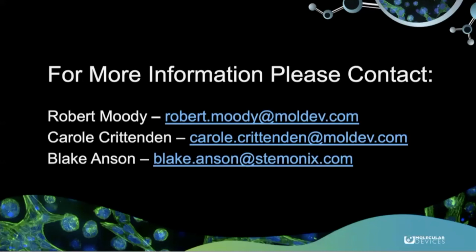Not built into the software, but we are able to pull out quite a bit of granularity and robust features across the phenotypic output, and that is then ready for the leap into AI and machine learning. And we're doing that both from a toxicity standpoint as well as a phenotypic rescue of disease lines. That makes sense. Thank you for the clarification.